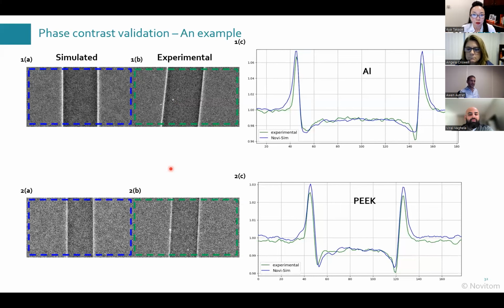At least not yet. But on the experimental images, you will still have some defects like dust. On synchrotron, as the setups are mounted and dismounted a lot of times, you have dust behind the scintillator, dust inside the lenses. And the scintillators are damaged. You have a lot of defects that you're not seeing in the simulation. This is true. Yeah, thank you for that.